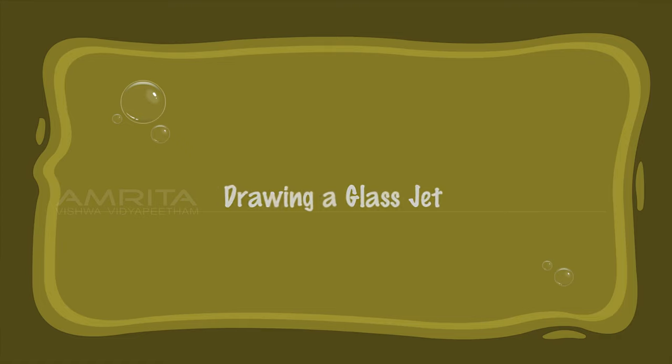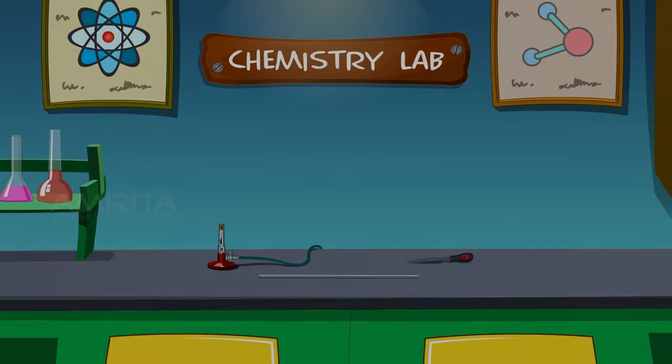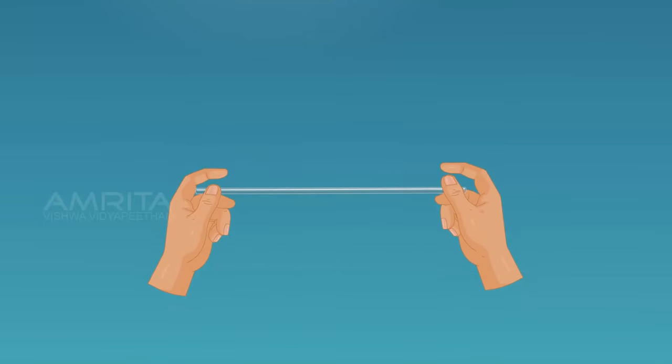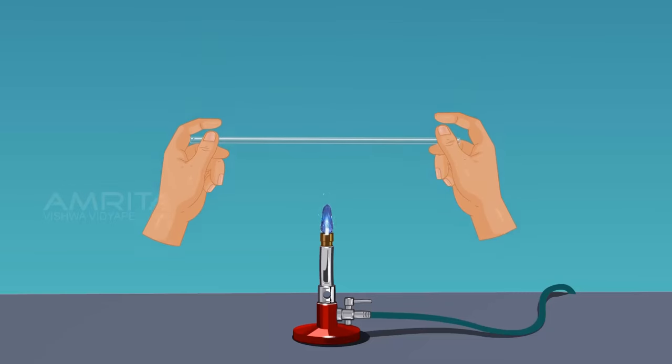Drawing a Glass Jet. We require a Bunsen burner, a glass tube of required length and a triangular file. Take a glass tube of required length, hold it with both hands, and place it lengthwise in the flame.